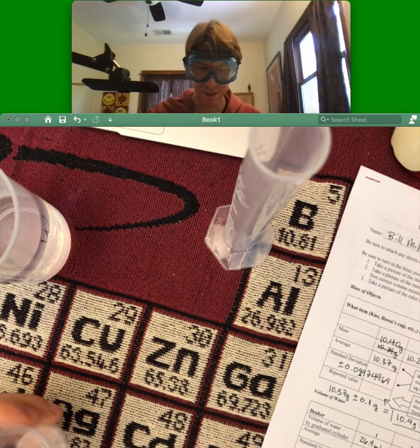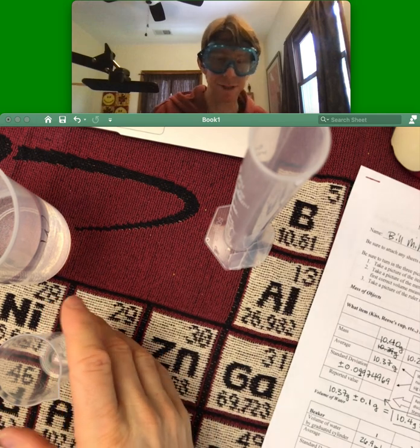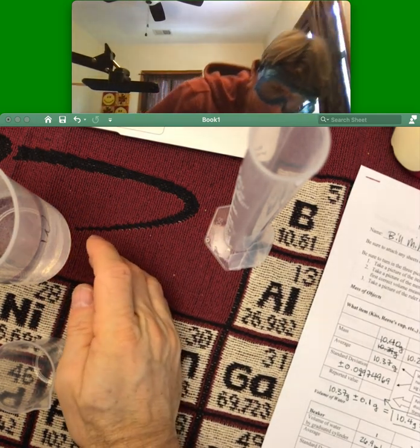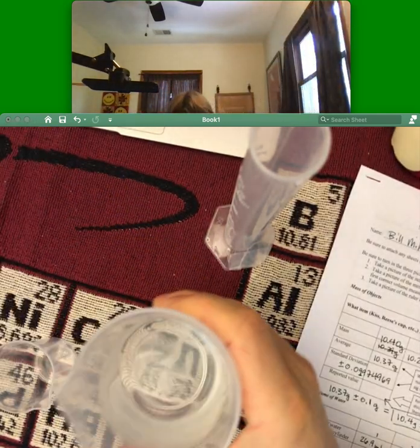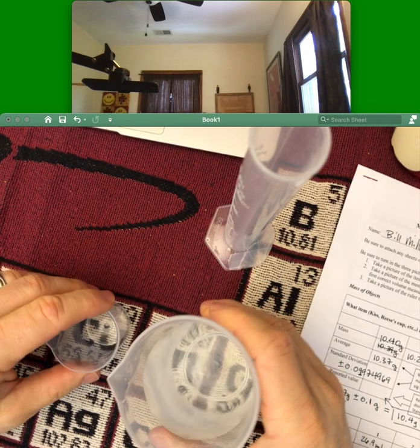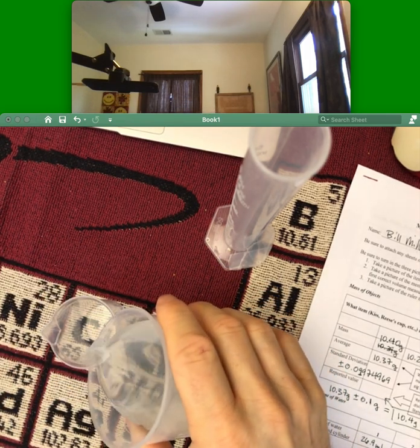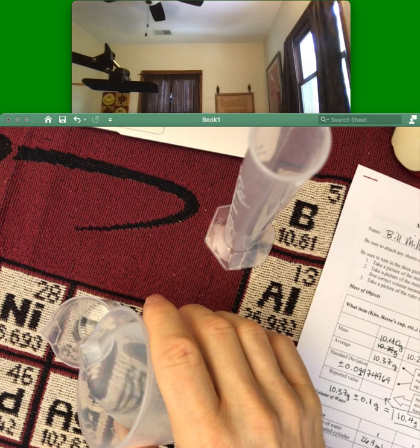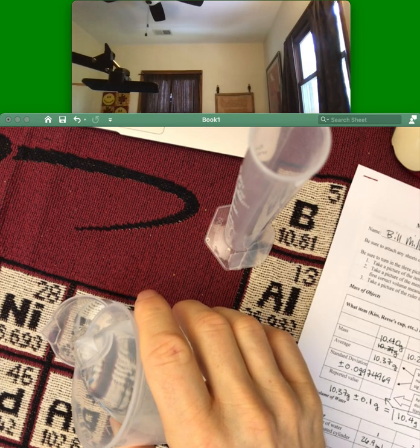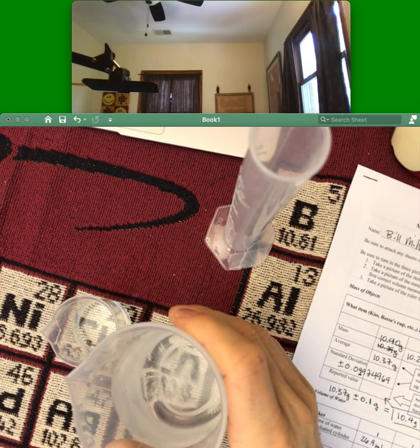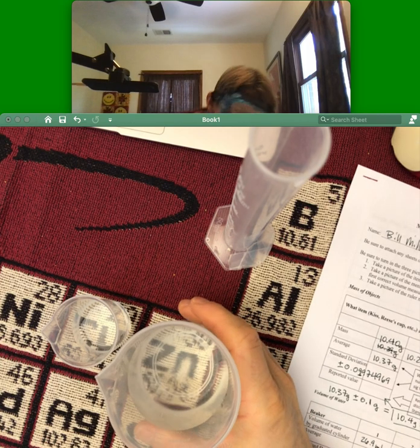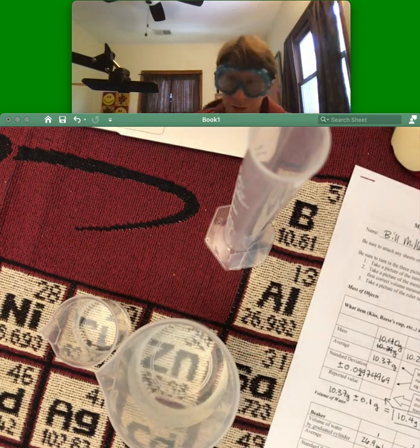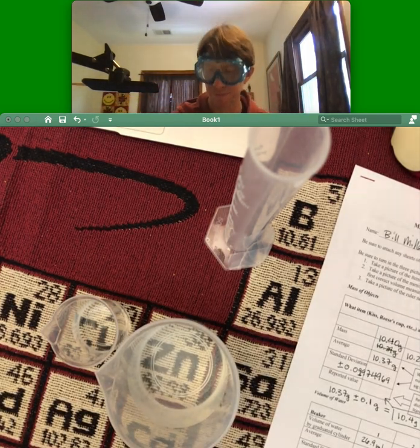Now let's go ahead and do this again. And I'm just going to immediately get down here, look straight across. And I think I'm pretty good that time. That was the best way to do it is look straight across while you pour it.